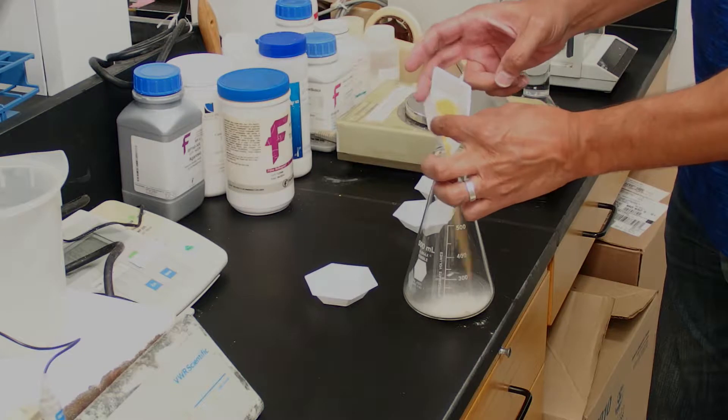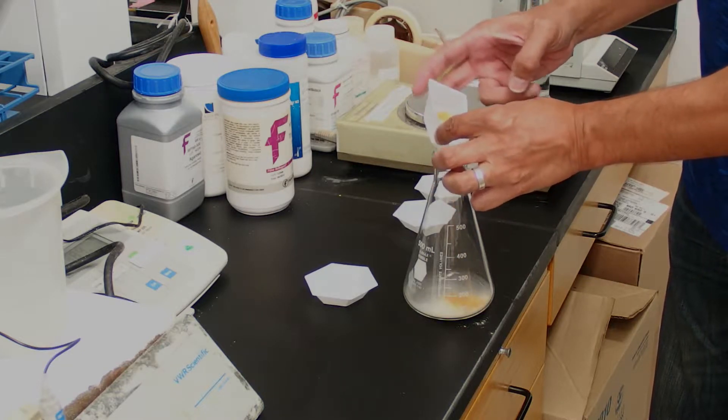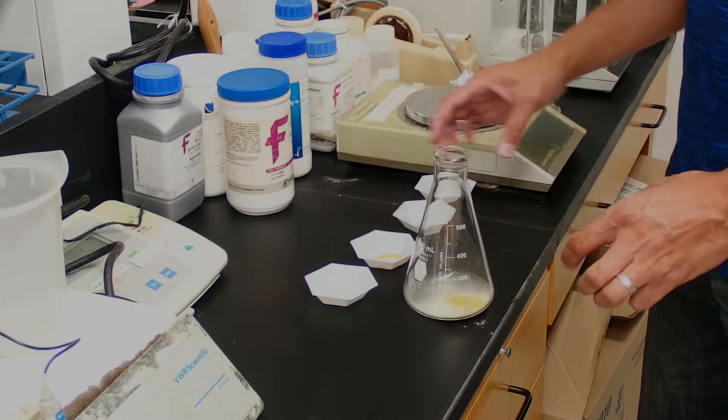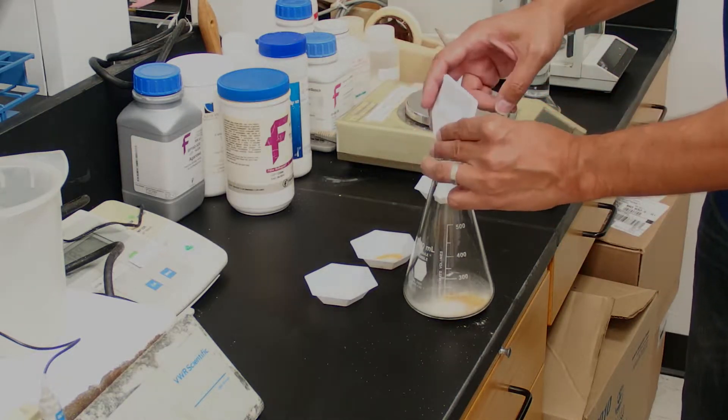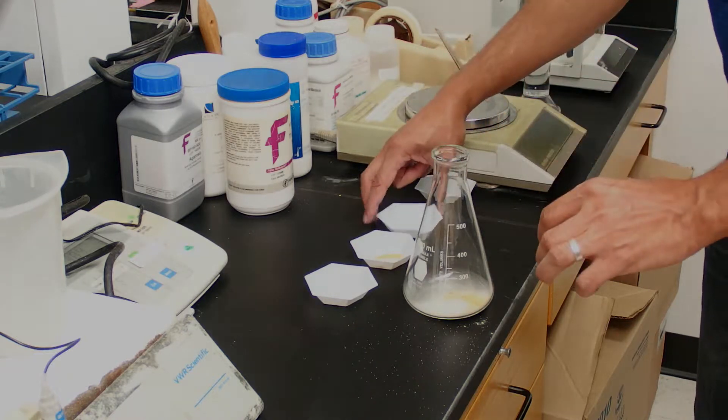Now if we want it to be more exact, we would add all of these things to a beaker, dissolve them, bring them to volume. But here what we're going to do is just make this directly in the flask because it works good enough for making agar plates.